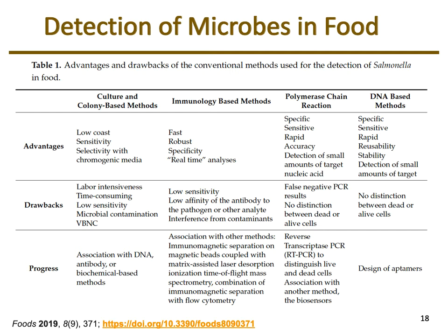Again, really focusing on the culture and colony-based methods, because these are the traditional microbiology methods, ones, again, you would have learned in an intro micro course. So definitely has advantages on the cost of material-wise, but then the drawbacks would be it's very time-consuming.